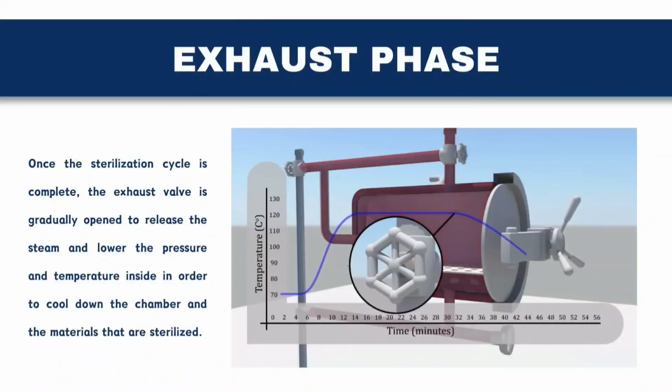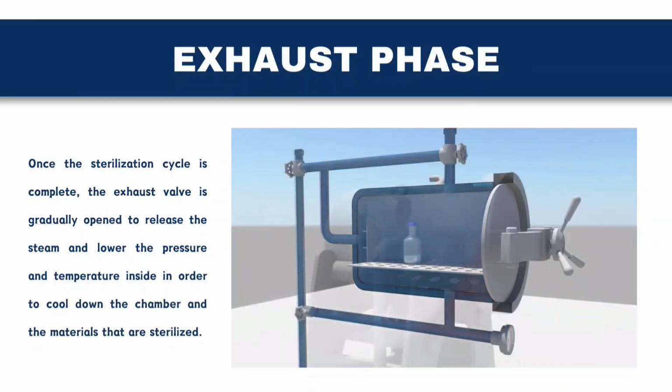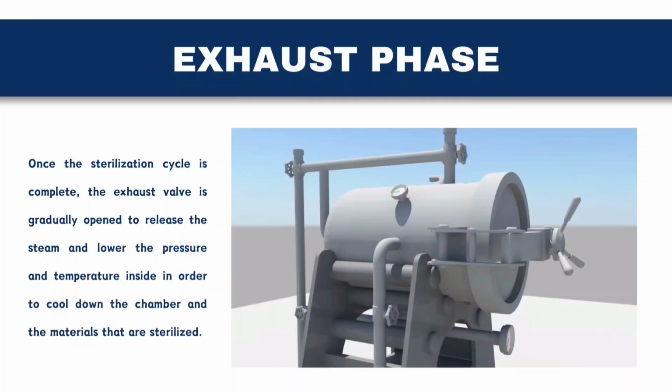Exhaust phase. Once the sterilization cycle is complete, the exhaust valve is gradually opened to release the steam and lower the pressure and temperature inside, in order to cool down the chamber and the materials that were sterilized.